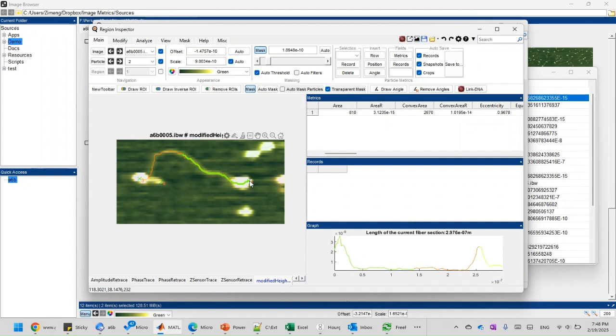That's how I do it the second way, which I call sequential mode, from the first point to the last point. And the first mode is the middle point mode, you can call it that. The program determines the first and the last point, which you can manipulate, and then you can add the middle points in between them. The midway mode, I guess. Right now I can move these a little bit just to make sure it reaches the edges of the protein molecule.